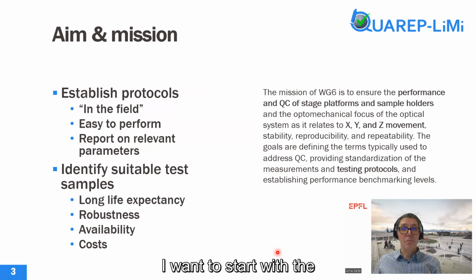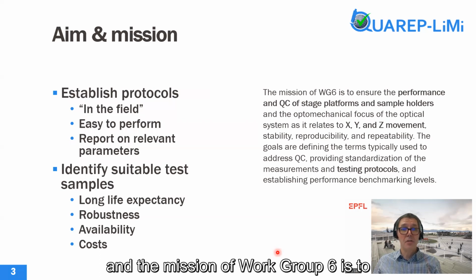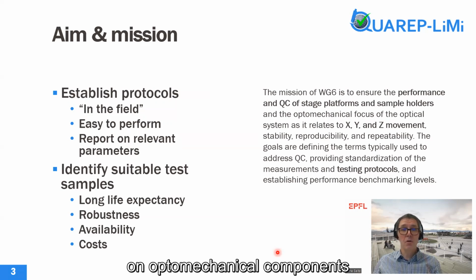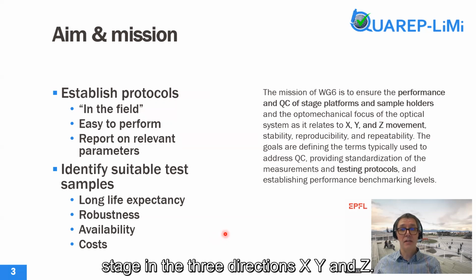I want to start with the mission of Workgroup 6, which is to develop protocols which can be taught on optomechanical components, which are typically attached to a microscope in order to move the stage in the three directions, X, Y, and Z.